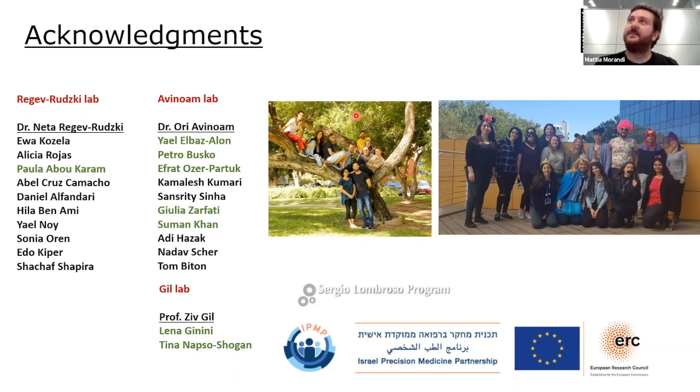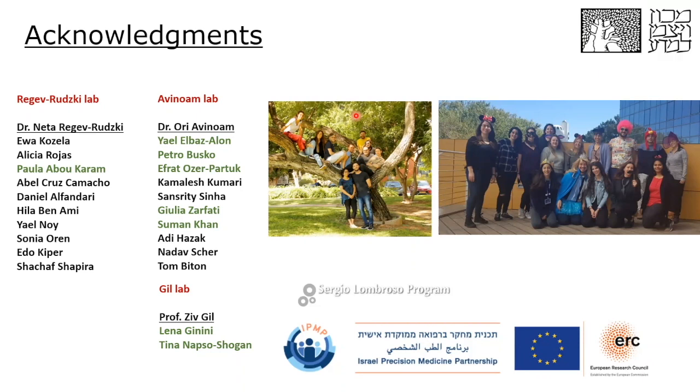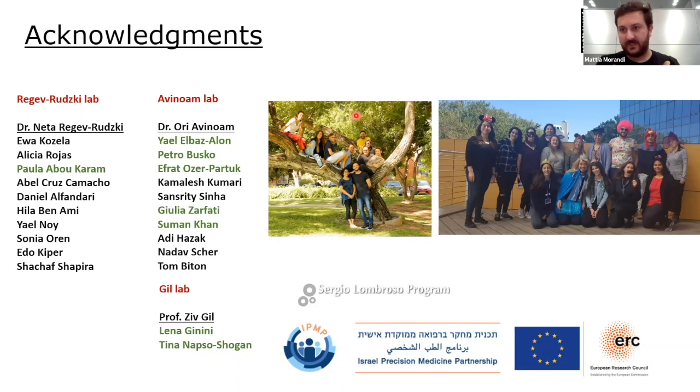So this assay, being in vitro, what we do to increase the output is we pre-incubate the EVs with the liposome at 4 degrees for half an hour, because it allows us to maximize the contact between them. So that tells you already that the fusion event implies that the EVs might be in contact with each other. So it depends on the concentration, really, and the time in which you maintain them. A highly concentrated system will determine how many fusion events you have. If you have an incredibly diluted sample with very low concentration of vesicles, even if you acidify, the chances that they come into contact with each other in the time frame that the fusion can happen is still limited, I would say. Okay, perfect.